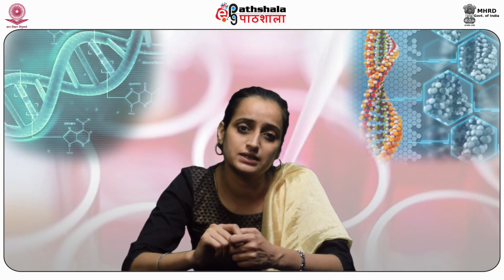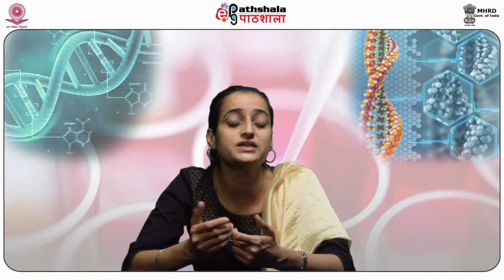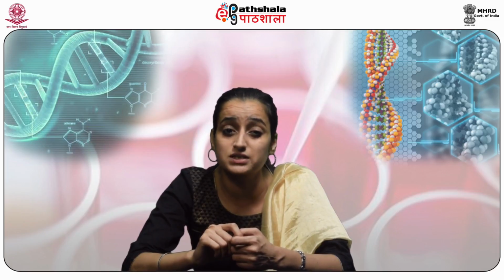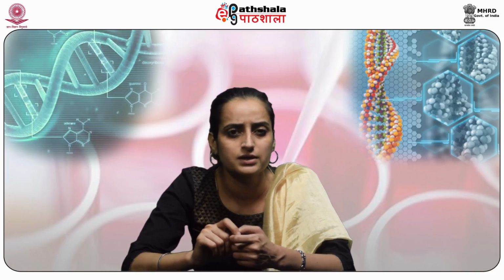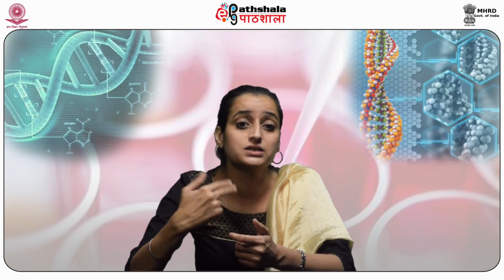Four types of probes are currently available to carry out the process of in-situ hybridization. Probes can be synthesized synthetically from commercially available oligonucleotides if the target sequence is known. Single-stranded DNA probes are 200 to 500 base pairs in length and are expensive and time-consuming to produce. These can be produced by reverse transcription of RNA template or by PCR amplification. However, if the sequence is not known, then double-stranded DNA probes can be used.